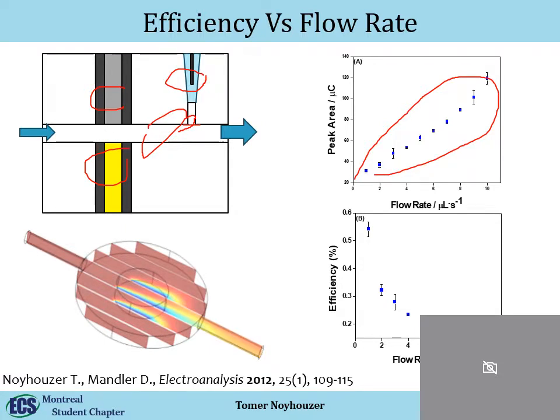And you can see here, this is the liquid that enters. All of this is actually dead volume, and only a very low amount is affected exiting. So the faster I flow, the lower my efficiency is. So if efficiency is something that is important to you, again, you're measuring something that is very expensive or hard to get, like a biological sample, then you want to flow very, very slow, so you won't use too much of your liquid or your sample. But if you're doing an analytical measurement and the only thing that is important for you is level of detection, you want to reach those PPT levels, then you want to flow fast. So this is like a dilemma and something that you need to be aware of.